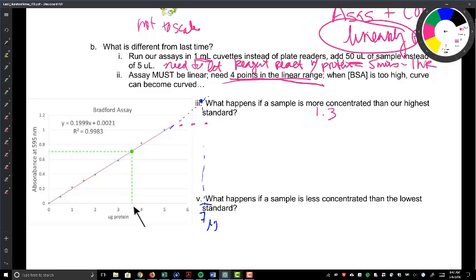Some of your higher concentrations might be flattening out, and you have to throw out those points, and you can't measure past your top point. So again, the only range that we can accurately quantify is within the highest linear standard, down to the 0 point. Ideally, you would be between your lowest concentration, that's not 0, and your highest concentration that's within the linear range.